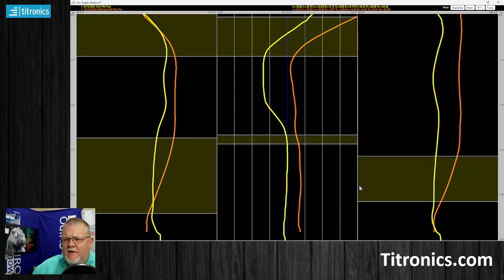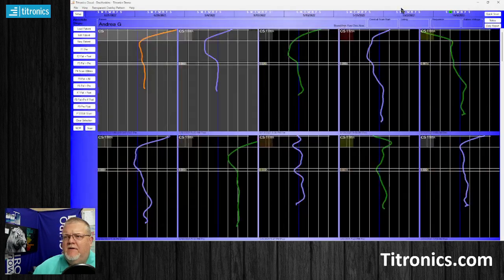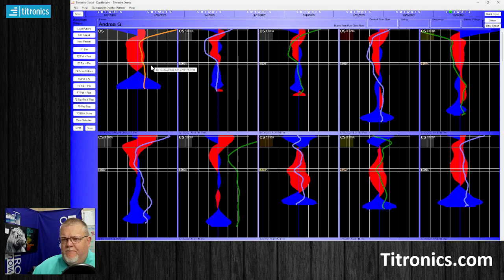So this bar graph on the left is going to show us, especially on the relative, where the highest relativity is, which is going to be the whitest. The lowest relativity is going to be the darkest, the black square, and then the absolute: so absolutely the same, not the same, similar. I know that's a lot of stuff to take in, but when you have this selected, now, when you look at these scans here, when you do your scan on the delta T, the calculation is going to show up when you do your scan.